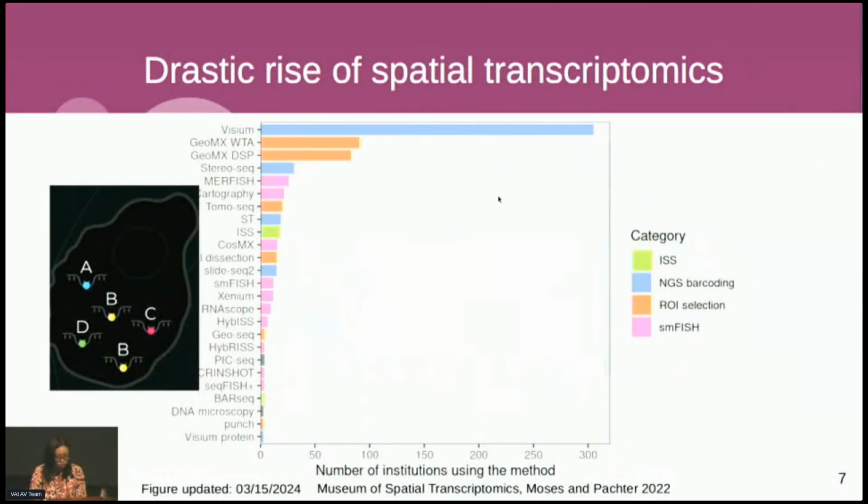Another major type includes MERFISH, Molecular Cartography, CosMx, and Xenium, which are in situ technologies. Those are imaging based, and in these technologies we can visualize each mRNA molecule in each cell as a discrete puncta in space, and we can relate each spot to the gene it comes from.